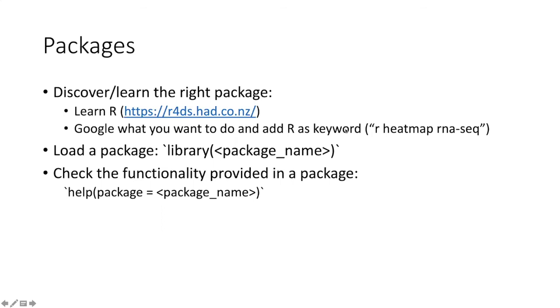You can just search R, heat map, and RNA-seq. You're going to see a lot of posts from maybe Stack Overflow or Biostars, or just someone writing a blog post about a specific package. So those are going to be very useful, and definitely use this method, which is going to be universally applied.